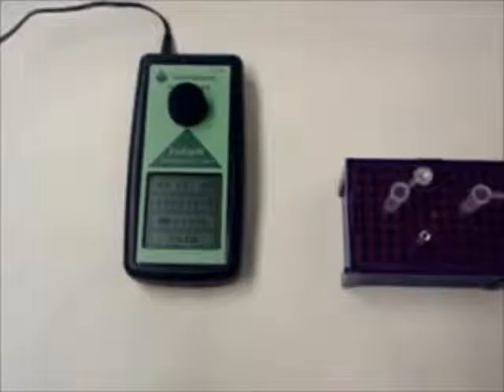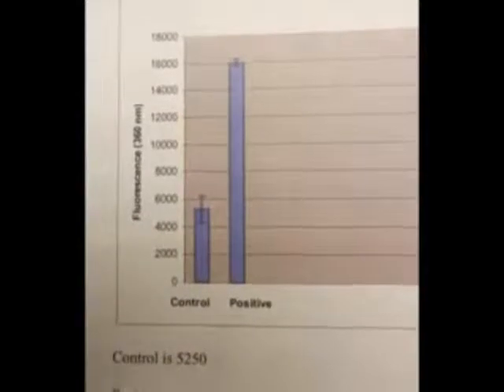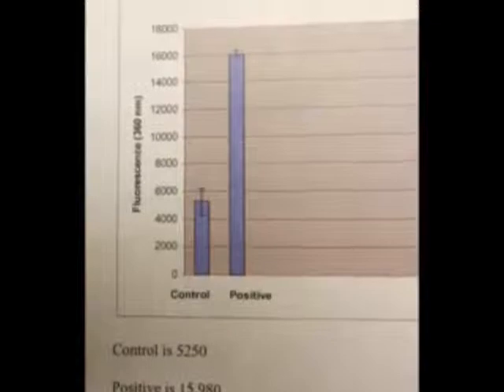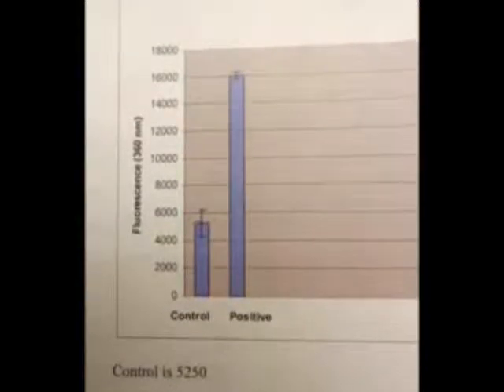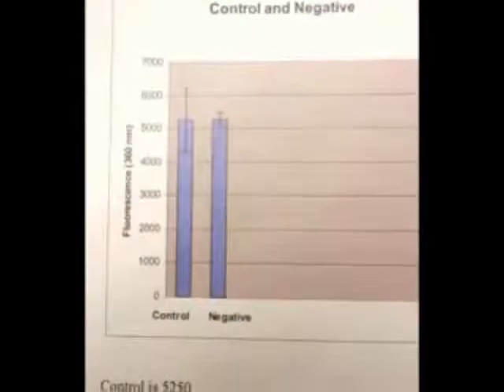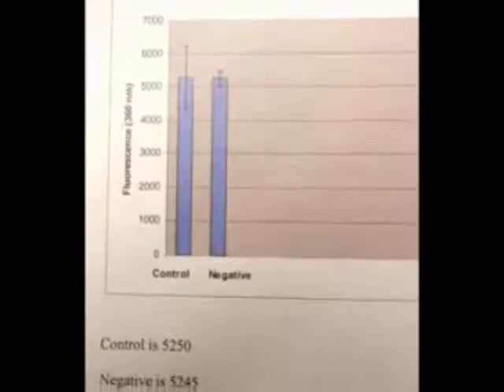If the numerical difference of the sample is higher than the control, then the sample is positive. In most cases, there is an obvious numerical difference when the sample is positive due to the number of fluorescent tags present from the reactions between the substrate and the enzyme. If the numerical value of the sample is the same or less than the control value, then the sample is negative.